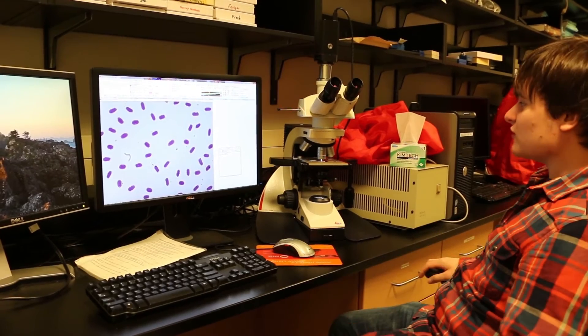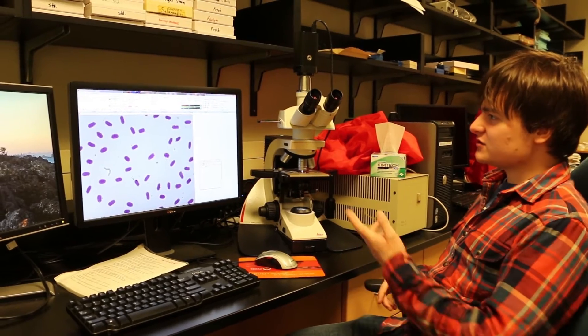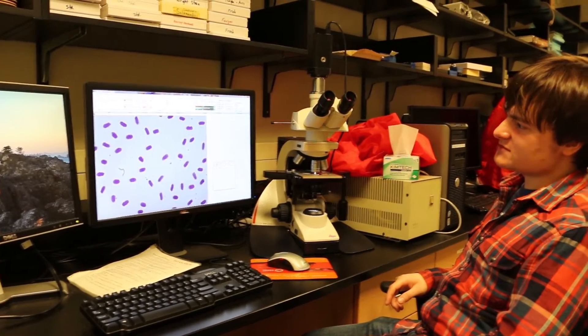So this is the scope room. This is where I go once I have blood from each fish on a microscope slide, and I've stained it to actually analyze the genome size of each species.